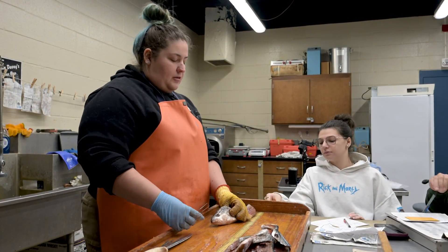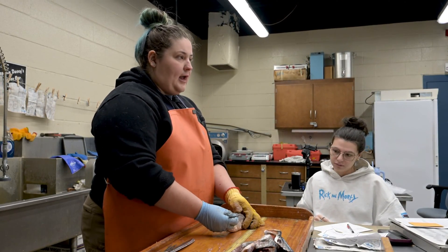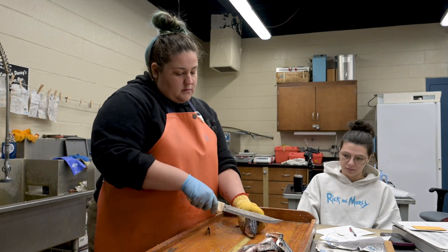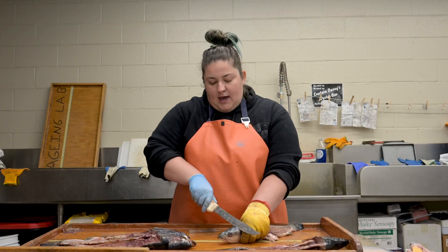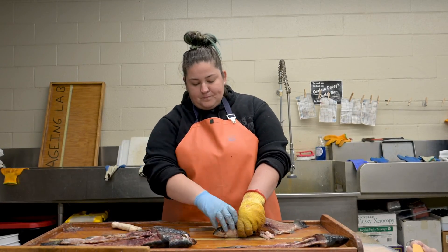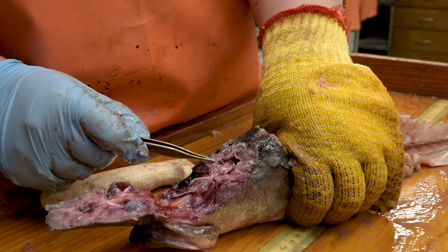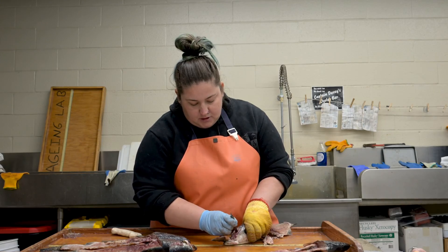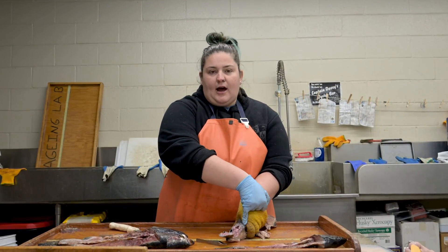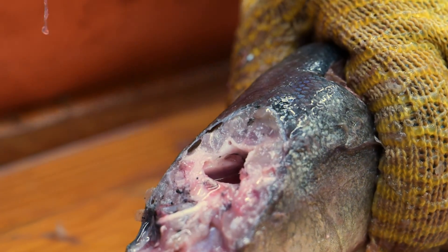Next we're going to go ahead and take out the otoliths. Otoliths are located right at the preopercal line behind the eyes and underneath the brain. I'm going to go ahead and make a diagonal cut and open it up. Right there is the brain — I will scoop it out of the way, and the otoliths are going to sit on either side of the brain. Take it out just like that.